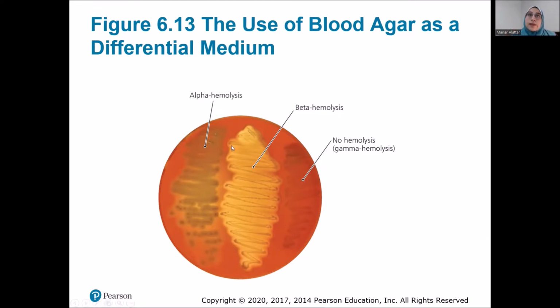And so instead of a full clearing in the plate, which was originally just this red color, and then once the organisms grew, it was cleared out, you just get a partial clearing. And we call this alpha hemolysis. Hemolysis, hemo referring to the heme that's in blood, and lysis referring to exploding or breaking apart.